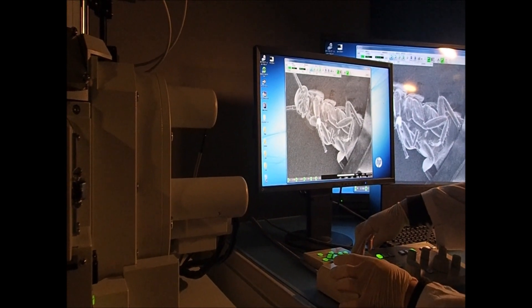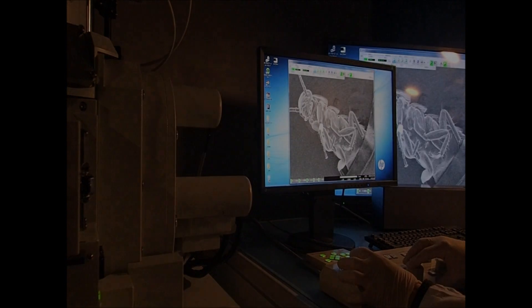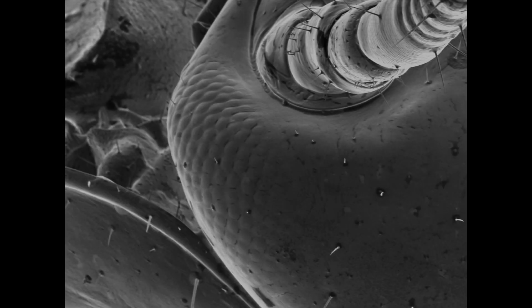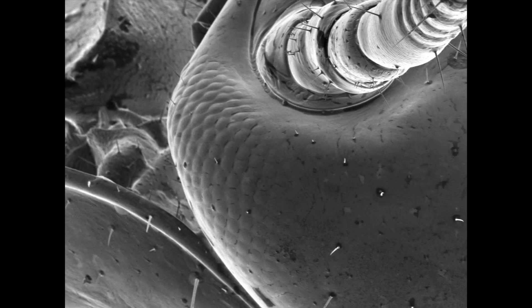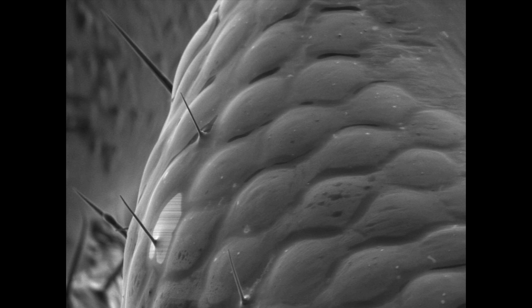Let's start the observation with nanosuit. Let's look at the head of a German cockroach. When you focus on the compound eyes, you can see that each eye has a characteristic surface structure.